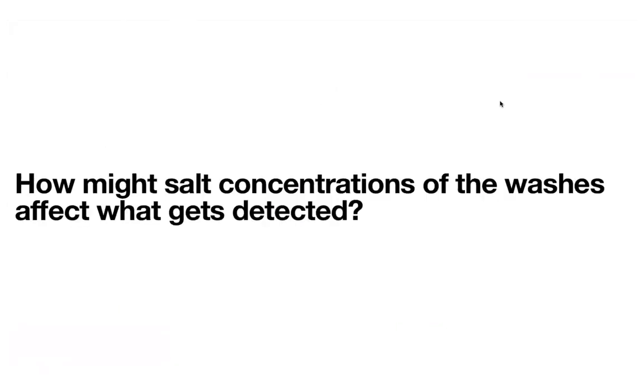How do you think their results might have been different if they had done a higher salt concentration? How might those salt concentrations of the washes affect what gets detected? Think about what you know about intermolecular forces.